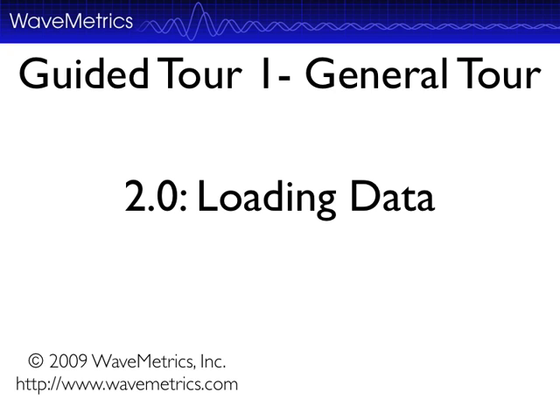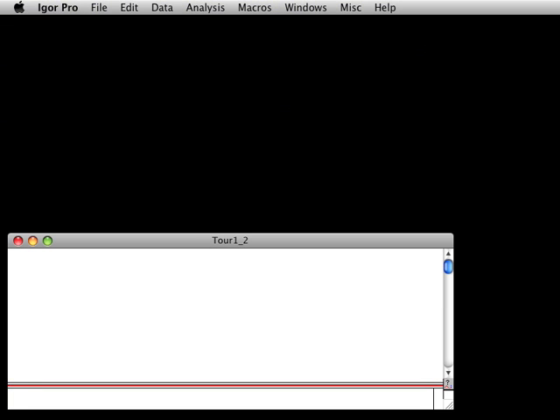Many IGOR users need to load data from a file created by another application or a device, such as a scientific instrument. IGOR can load data from many different formats. This tutorial will show you how to load data from a text file. IGOR comes with several sample data files, and I'll use one of them for this tutorial.